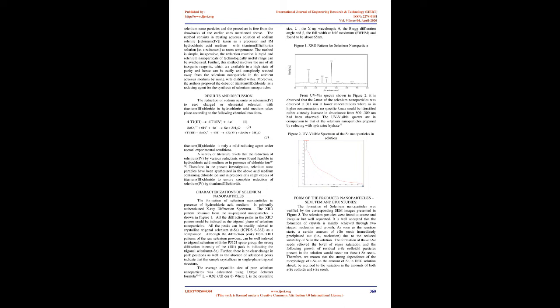The method consists in treating aqueous solution of sodium selenite, selenium(IV) taken as a precursor, in hydrochloric acid medium with titanium(III) chloride solution as a reductant at room temperature. The method is simple, inexpensive, the reduction reaction is rapid, and selenium nanoparticles of technologically useful range can be synthesized.